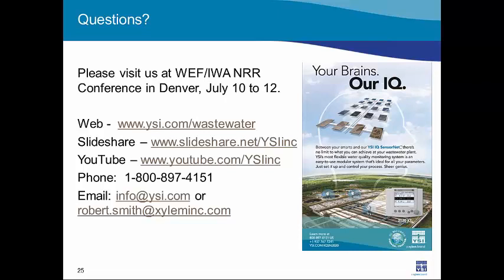Okay, for measuring nitrate at a wellhead, do you have a jacket to catch or measure the nitrate in a side stream? Yeah, so I guess you're getting outside of municipal wastewater here. That's okay. Nitrate and nitrite, we have had success monitoring those optically in, for example, groundwater applications.